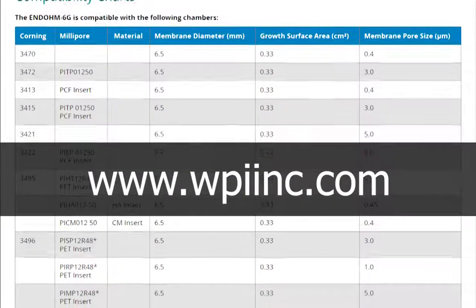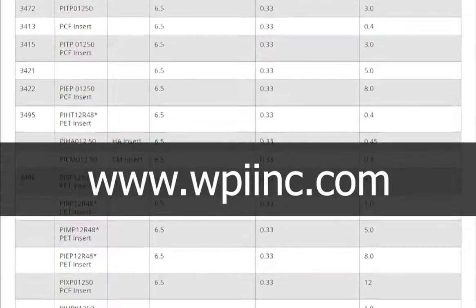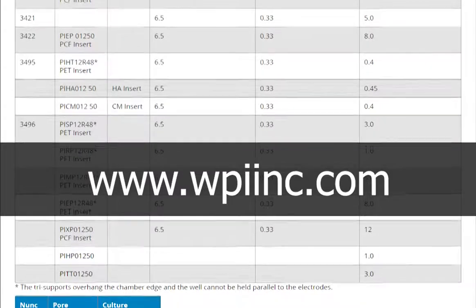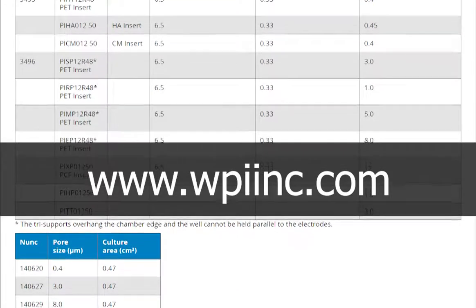Please check the WPI website for EndOhm compatibility with different cell culture inserts. Normally, EndOhm 6G is used for 24 well plate inserts, EndOhm 12G for 12 well plate inserts, and EndOhm 24 Snap for 6 well plate inserts.